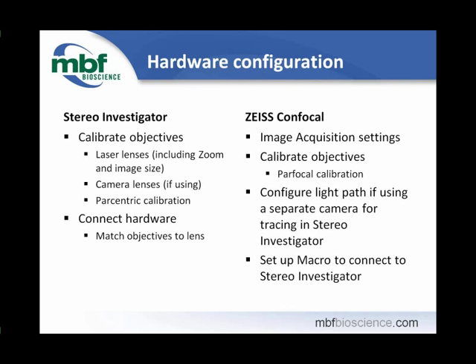Yeah, that's right. Because what we're going to do is combine the efficiency of using a digital camera for the very fast image acquisition display that you want to use for delineating a region of interest at low magnification, but at the same time we want to use the laser scanning confocal to acquire those crisp images at high magnification. The idea here being that the confocal is imaging one point at a time, so it takes a while to generate the image because you have to scan the tissue, whereas the camera can generate the image much quicker for you, correct?